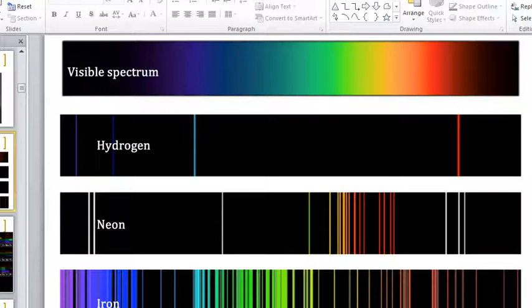That means the neon bulb, if I'm trying to measure neon, actually has multiple wavelengths that I can do my analysis at, right? If it absorbs at each one of these locations, then I have multiple choices of where I can go and make my measurements. There's going to be one of these colors that's the best for that specific metal. But if there's a problem with that one for some reason, I can move on to a second or a third or a fourth or a fifth color that I can do my measurements at.